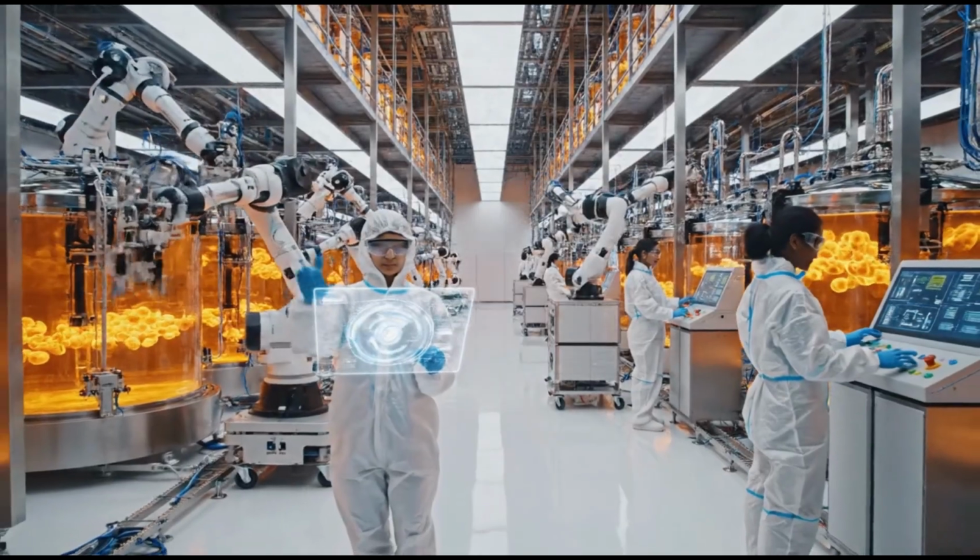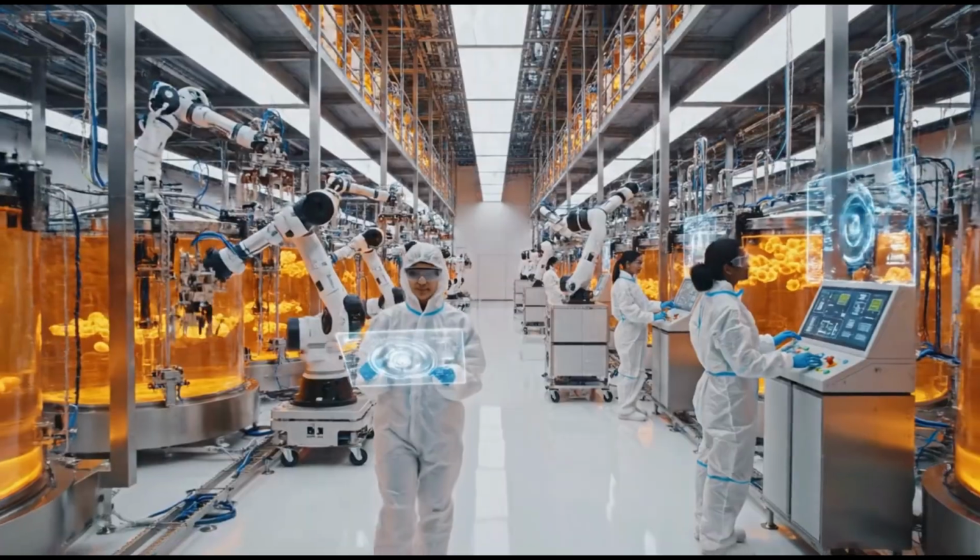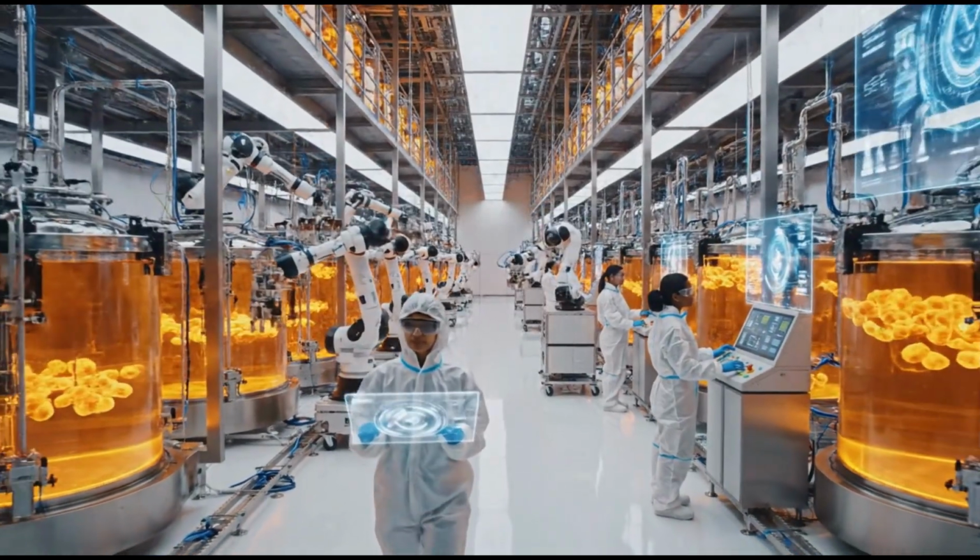The growth rate is exceeding projections. Confirmed. Adjusting nutrient flow accordingly.